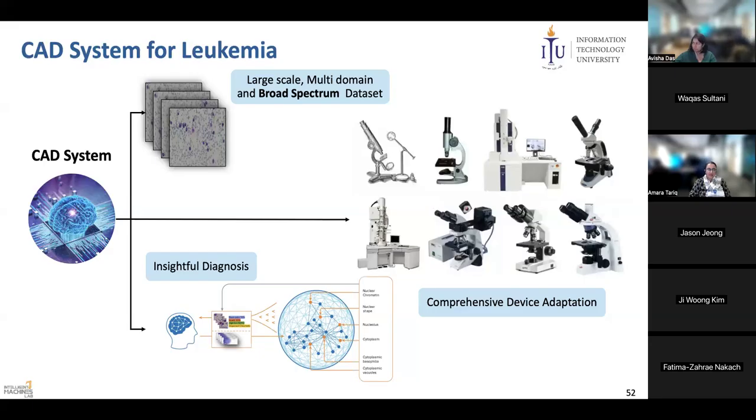He was kind enough to give us a medical book, and they have the morphological attributes. He told us that when we physically analyze these cells, we see whether it has nuclear chromatin, what the shape is, whether the white blood cell is big or small, whether the cytoplasm shows basophilia, whether there are cytoplasm vacuoles, something like this. So these are 7, 8 attributes, or more than that. They look, and based on that, they decide whether the cell is a myeloblast or neutrophil, like that.